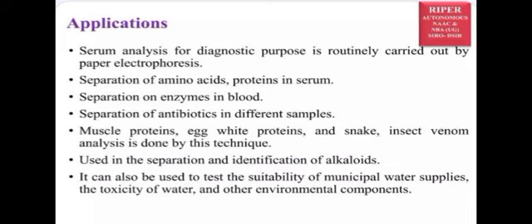It can also be used to test the suitability of municipal water supplies, the toxicity of water, and other environmental components. These are the applications of paper electrophoresis.